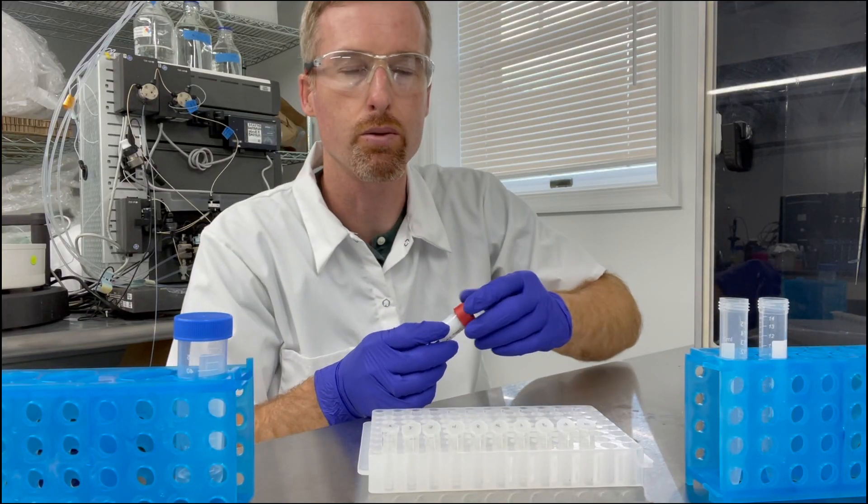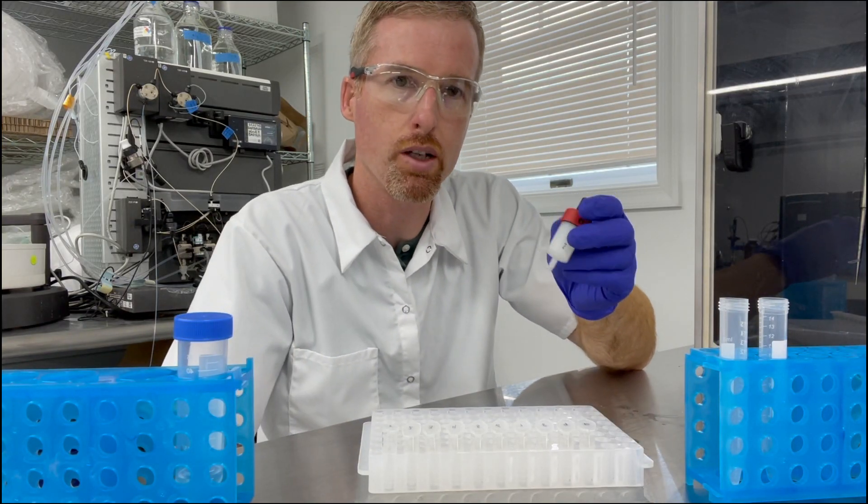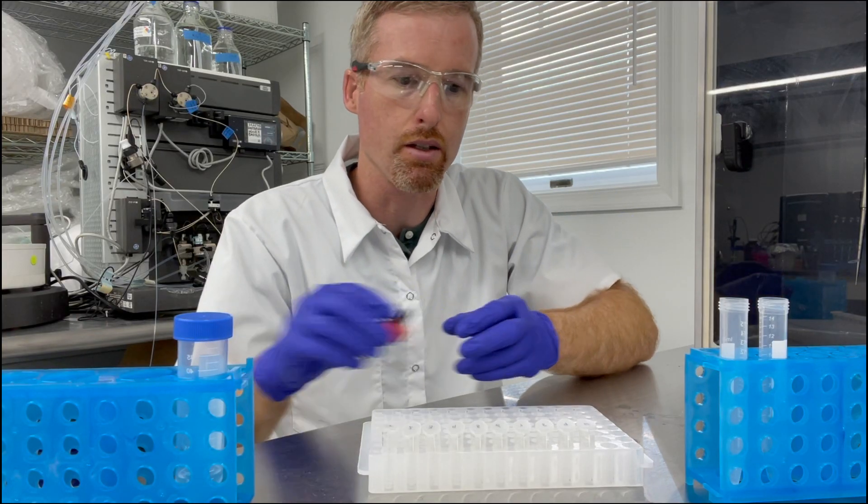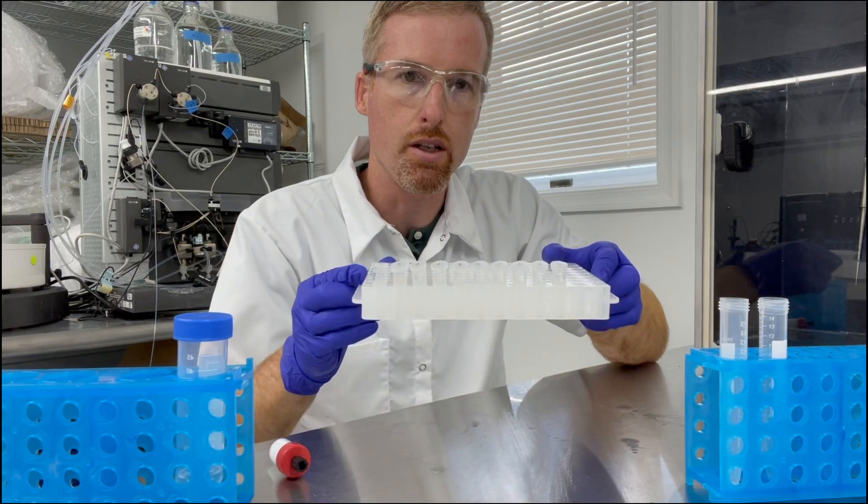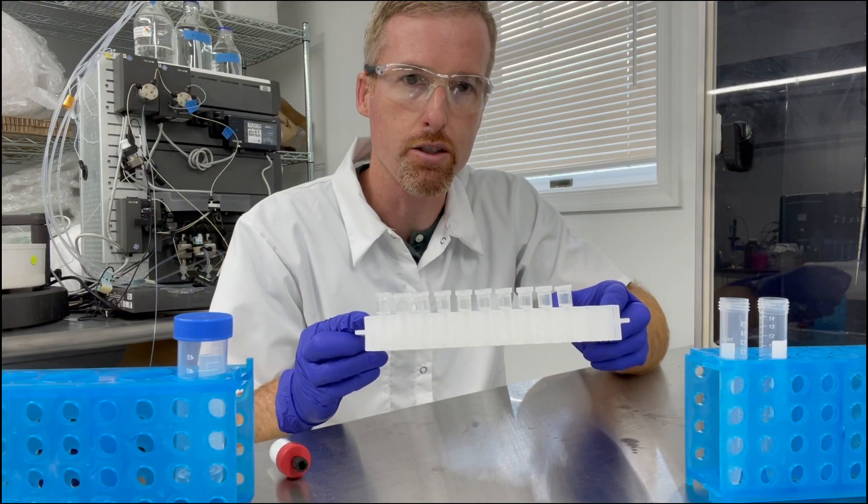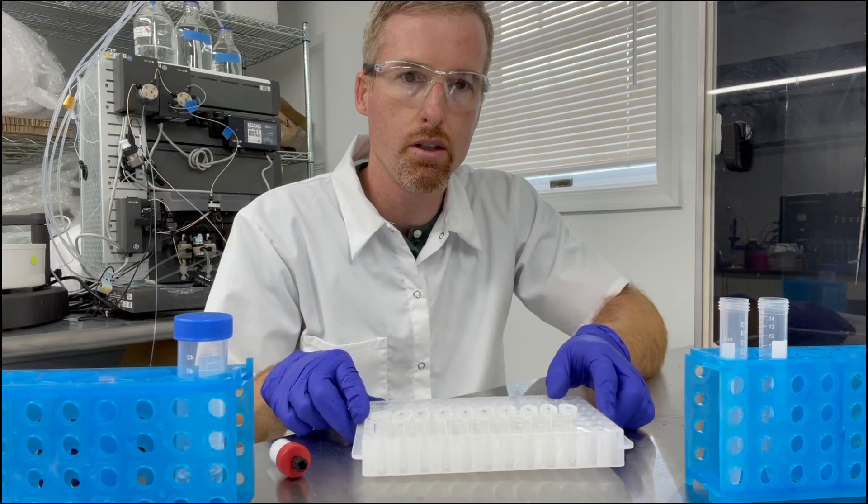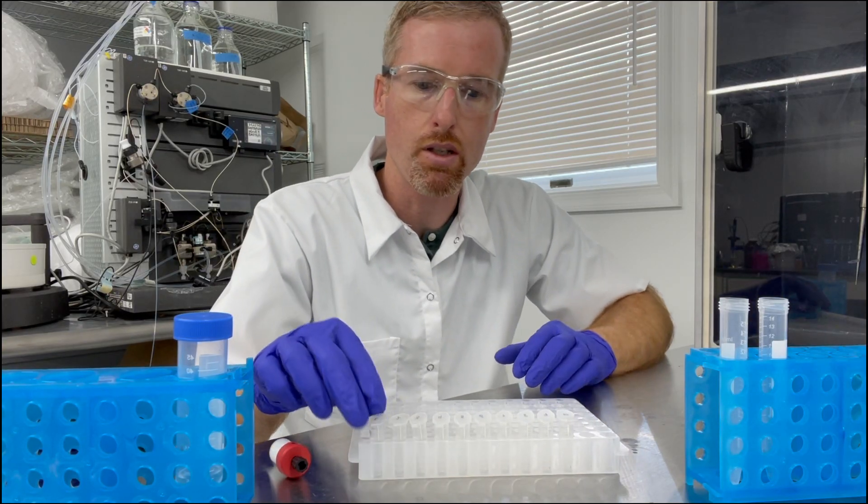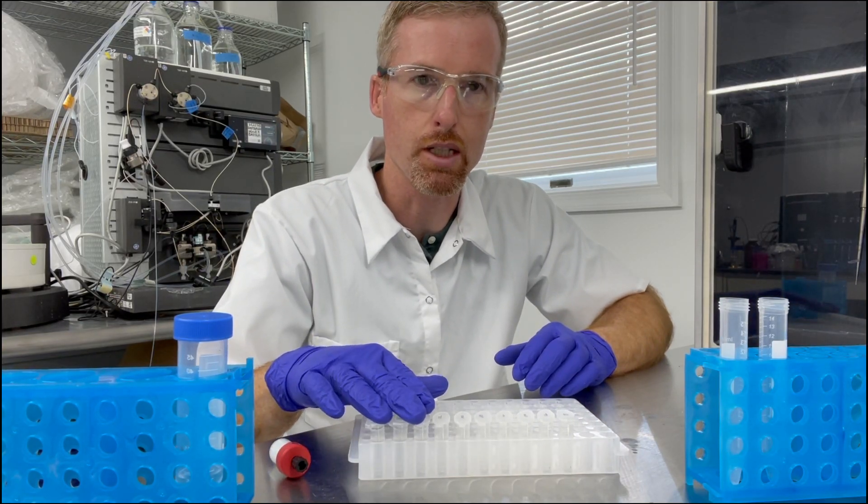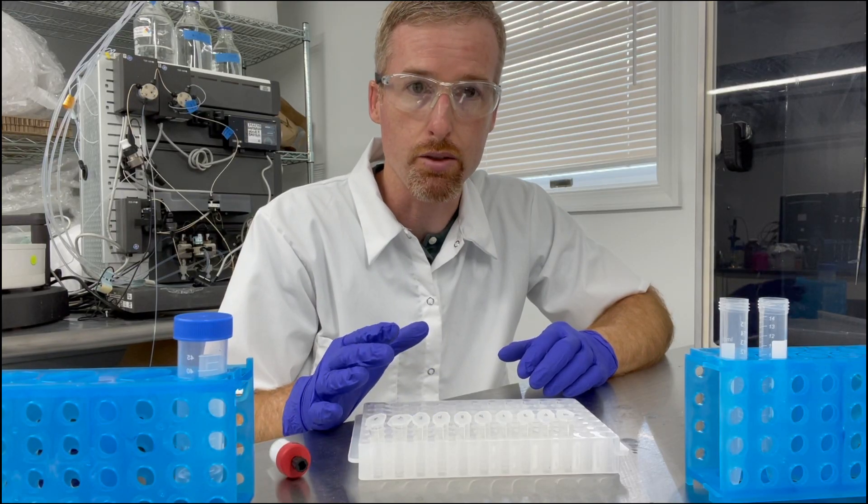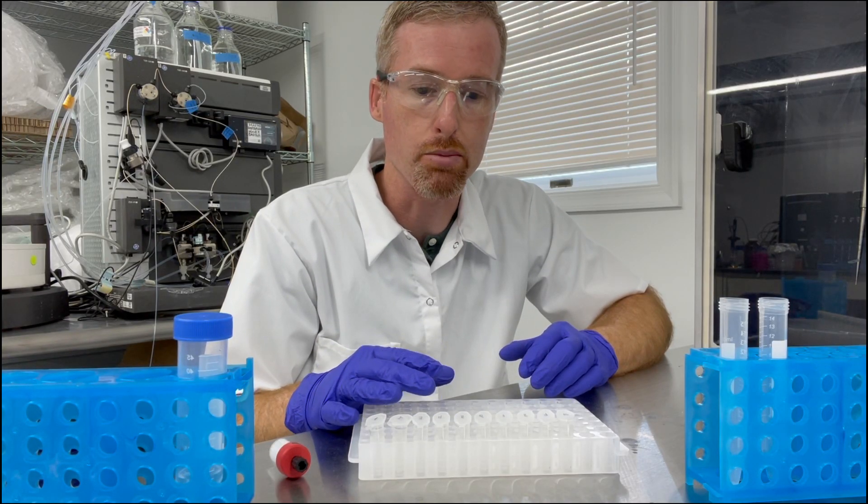Okay, so the column has been equilibrated with buffer A and I have here 10 one-mil fractions of protein that I eluted from nickel agarose.